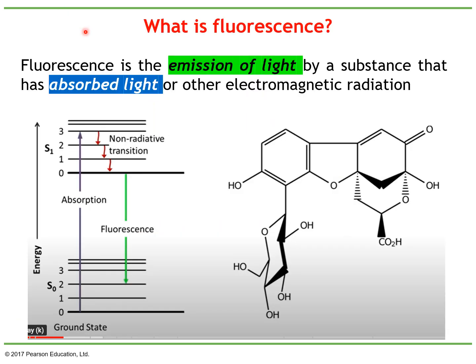Okay, so let's recap. I hope that you enjoyed the video, and now I want to remind you what fluorescence is. In the video they show you that fluorescence is the emission of light. In the beginning I show you people with different clothes that were fluorescent. I show you in the video bioluminescence, different organisms that are fluorescent, and what happened at the chemical level.